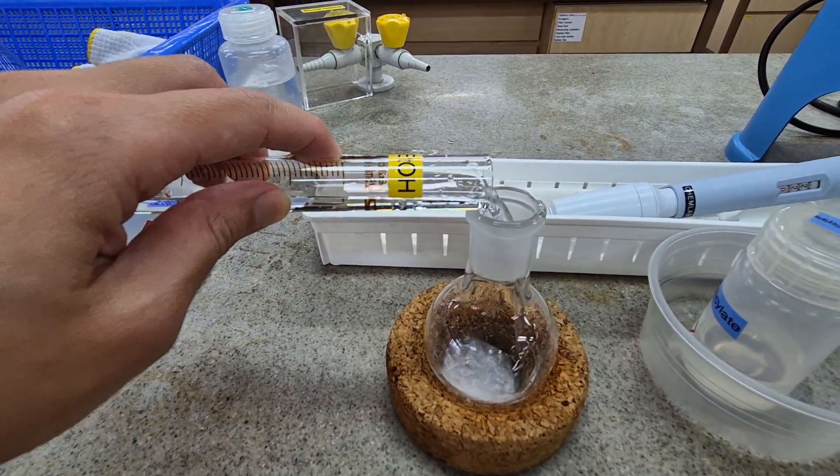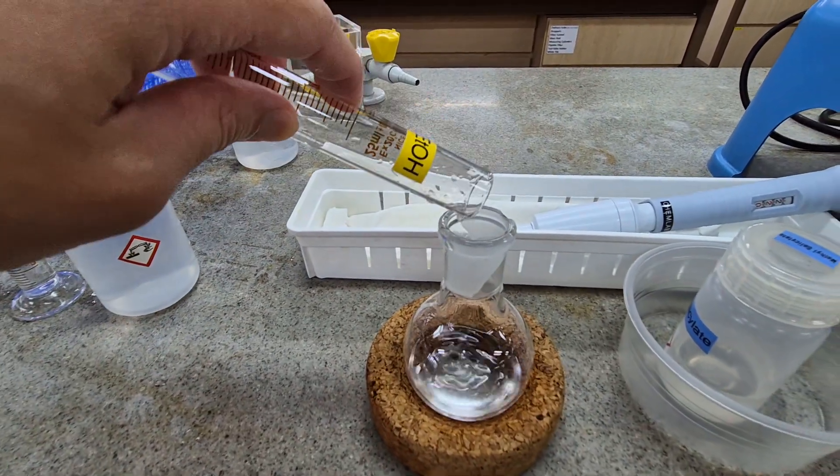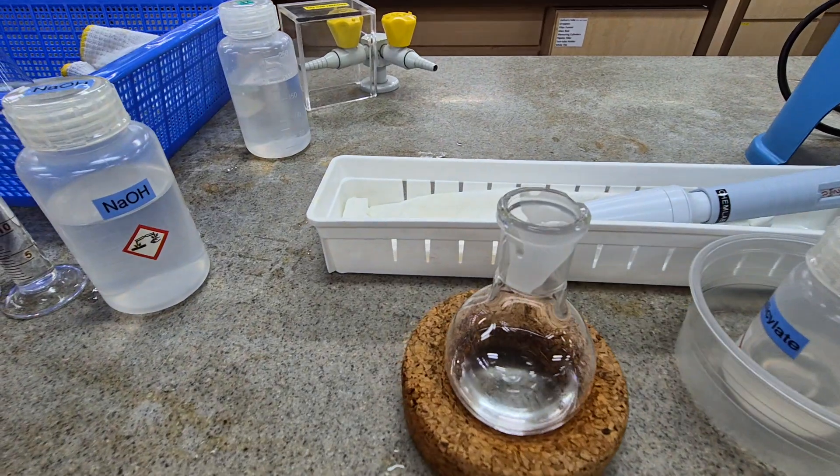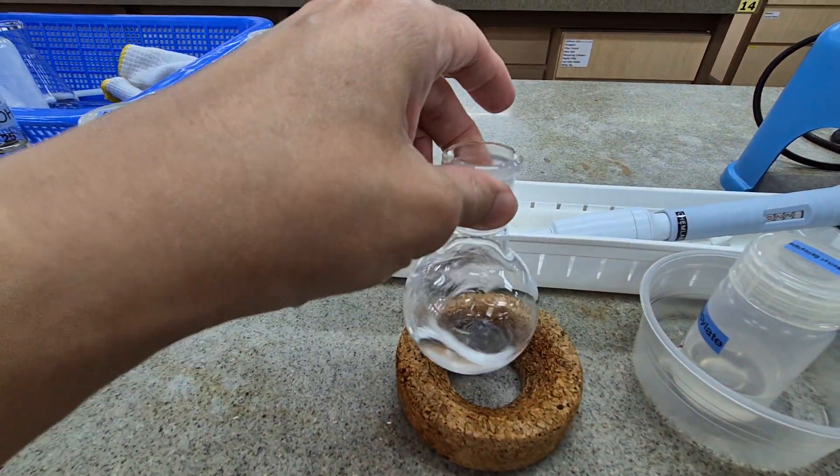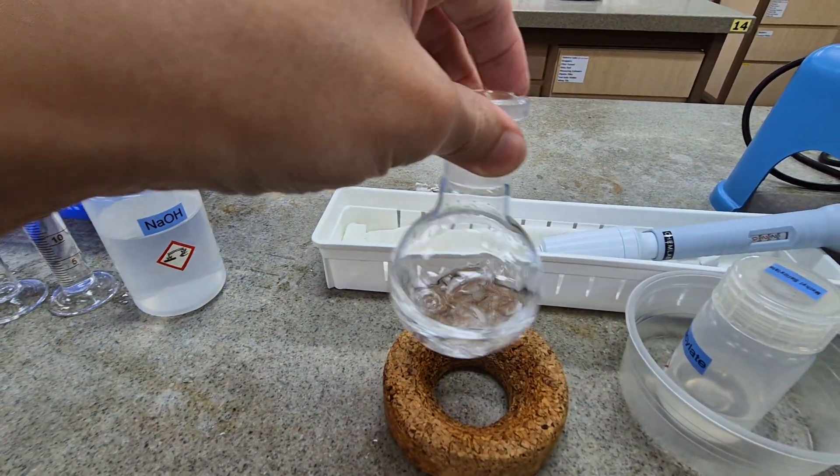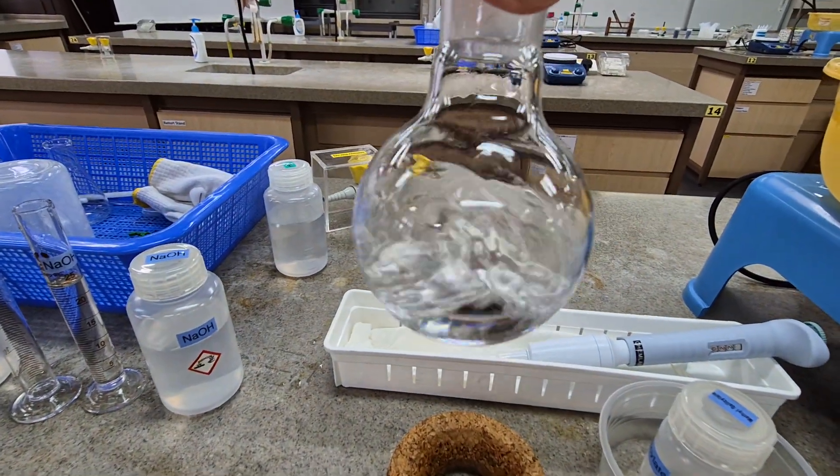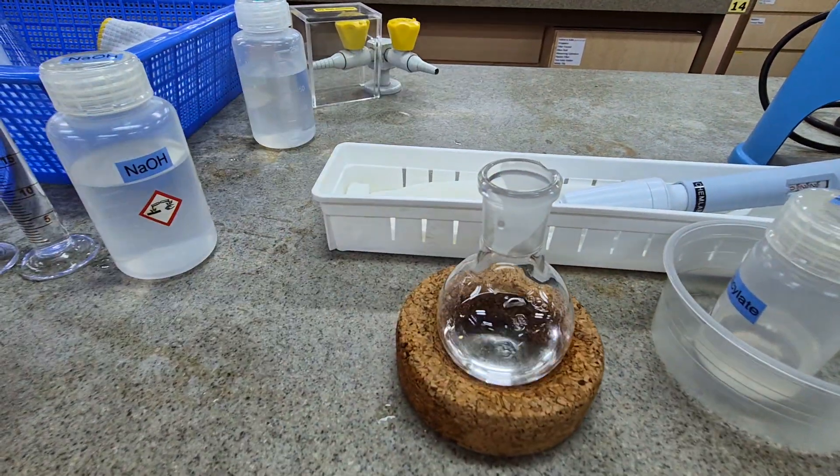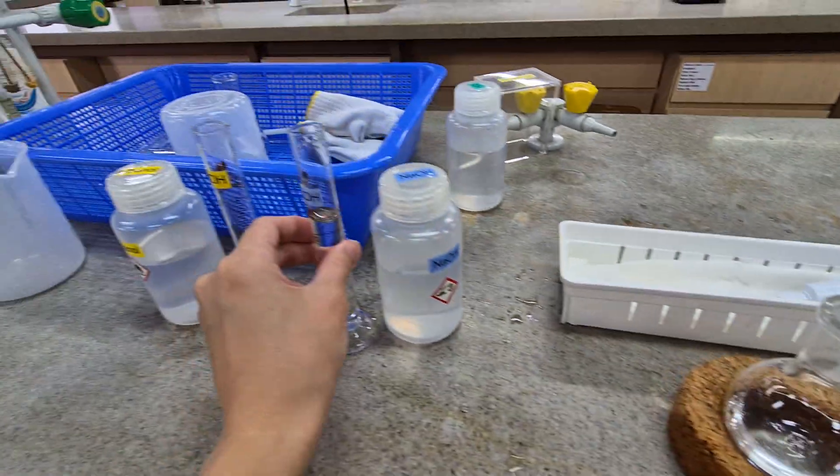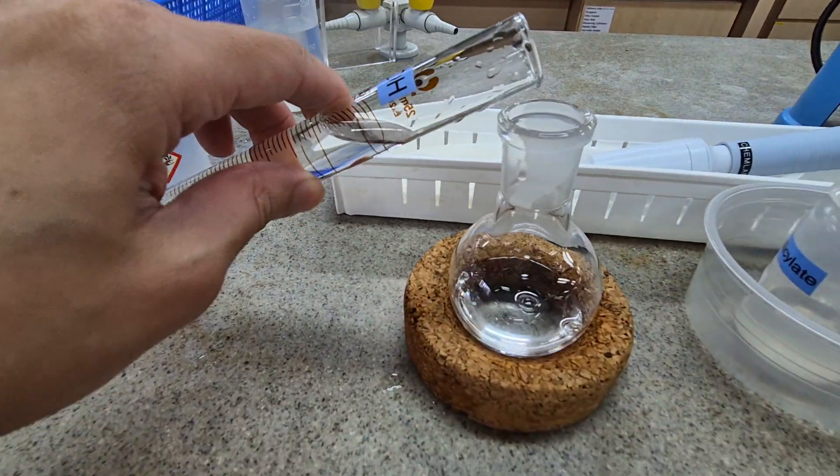I'm going to do a light swirl so the methyl salicylate will just dissolve in it. You can see that the solution is kind of colorless. Now please take note of the changes when I add in sodium hydroxide, very carefully.